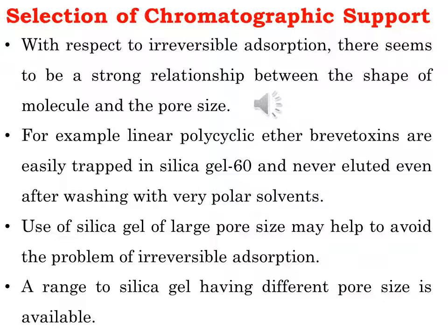Materials based on silica gel having different pore sizes are available commercially. For example, EM Corporation sells silica gel based columns with pore sizes up to 1000 angstrom. Needless to say, however, the larger the pore size, the smaller the surface area and consequently the lower the number of theoretical plates.